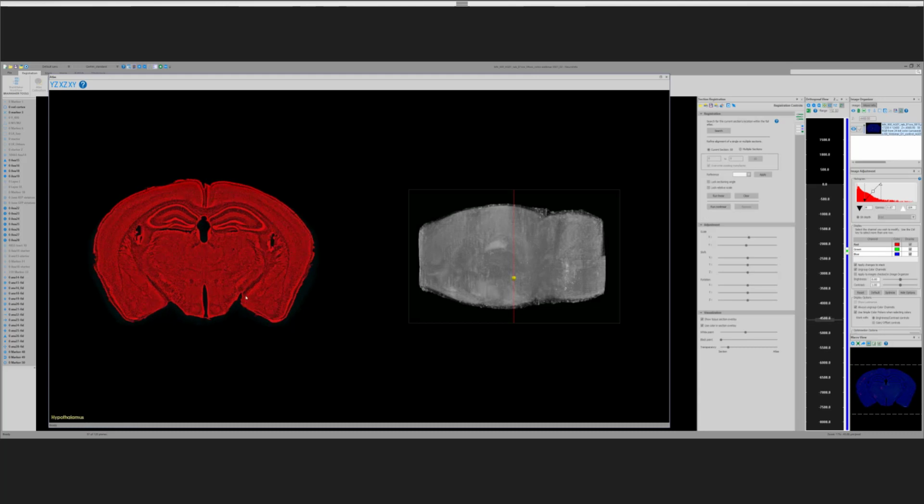Similarly, there are other fiber tracts that give us a similar indication, like the optic tracts as they come into the brain. Where they're located gives us an indication of where we are. The mammillothalamic tracts, the shape of structures like the amygdala, the basolateral amygdala. Rostrally, it just starts, and we can estimate where we are located in the Z dimension based on the location of these structures.